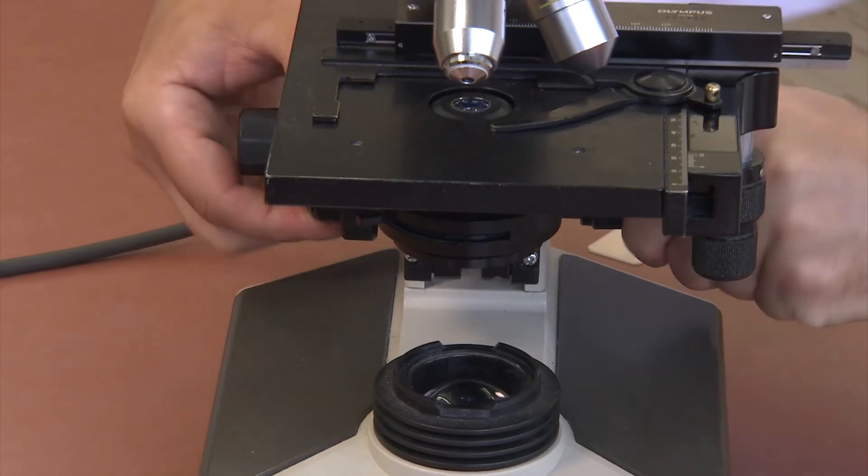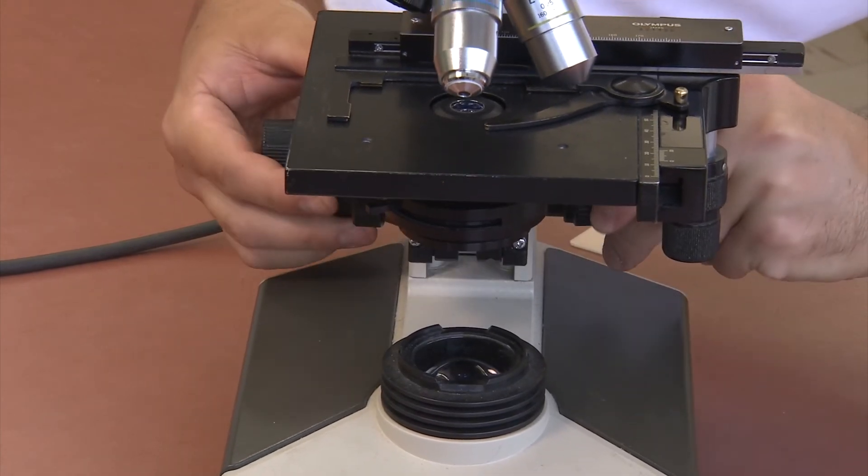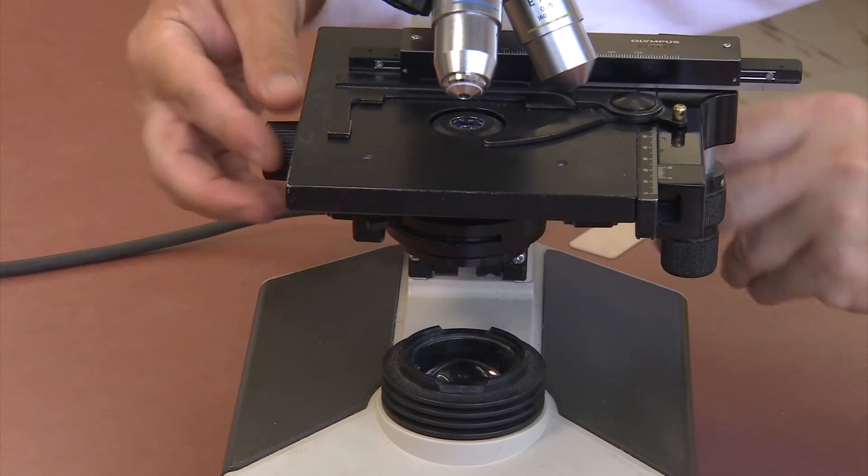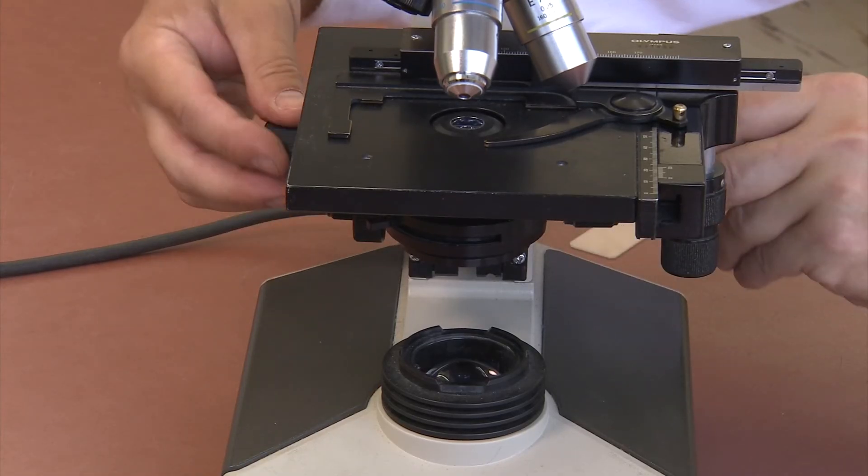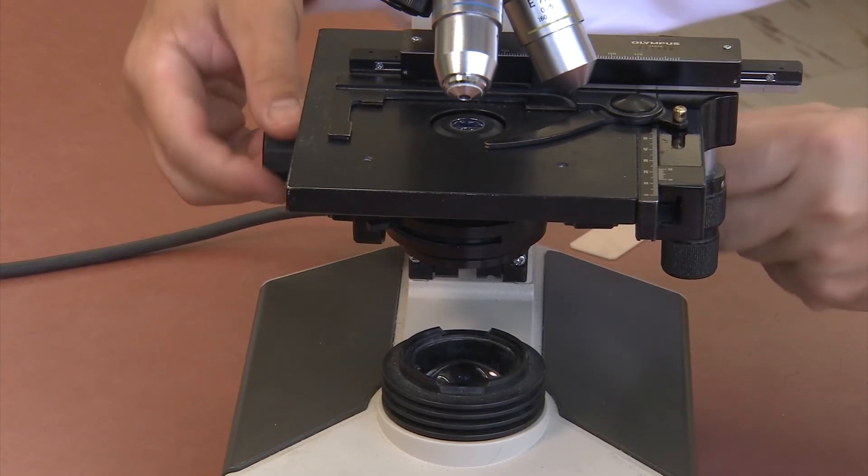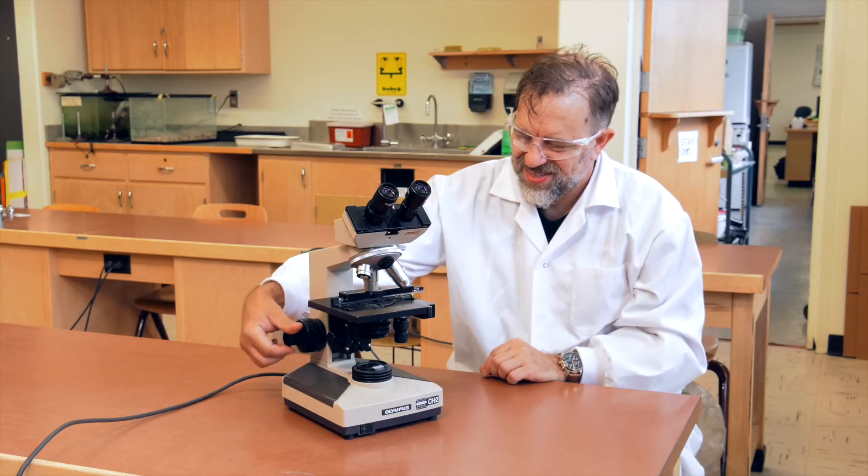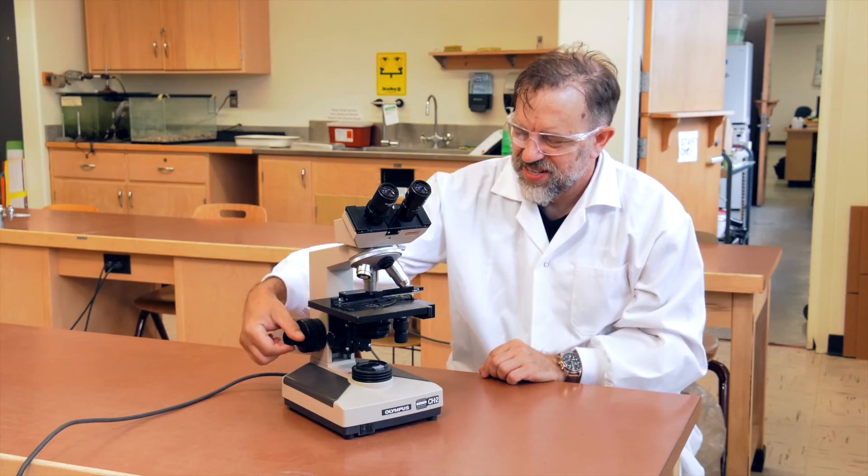As the name implies, the coarse focus is for large movements and should only be used when focusing using the 4x objective. The fine focus makes smaller adjustments to the stage height and is used for focusing on your specimen when using 10x and 40x objectives.